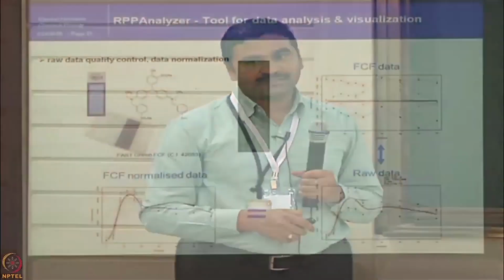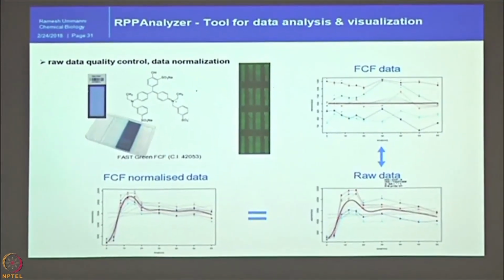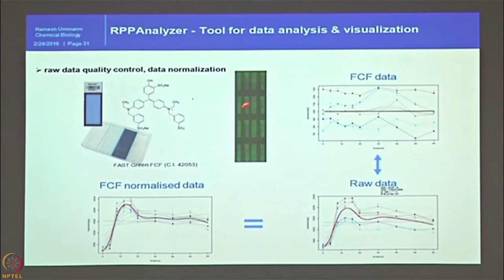How do we do it? We stain the slide with Fast Green FCF. This directly binds to the protein and we can scan the slide at the 800 channel in the infrared imaging system. This green color indicates the total protein. We can quantify it the same way as the antibody signal is quantified. You can already see in this plot that 5 or 6 different samples are going a different way depending on the time, and these signals can be normalized.